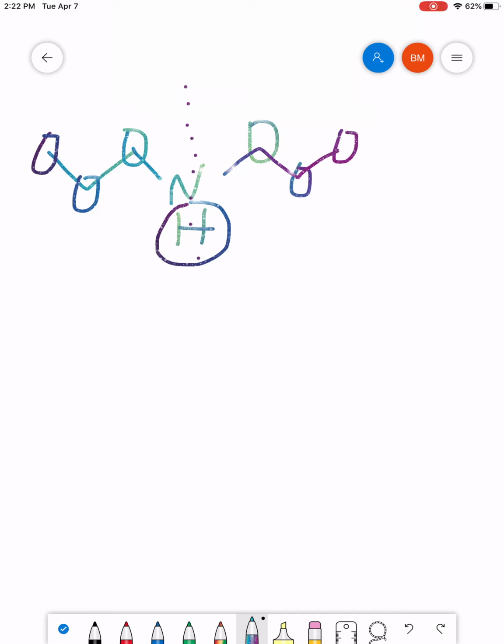All right. I think it's pretty safe to say that this one in the middle is quite unique, right? Definitely not like any of the other ones, so that's going to be its own group. And then we see the symmetry of the molecule here, so I would say these 2 methyl groups would be identical to each other. These 2 CH2 groups would be identical to each other, and these 2 would be identical to each other as well.